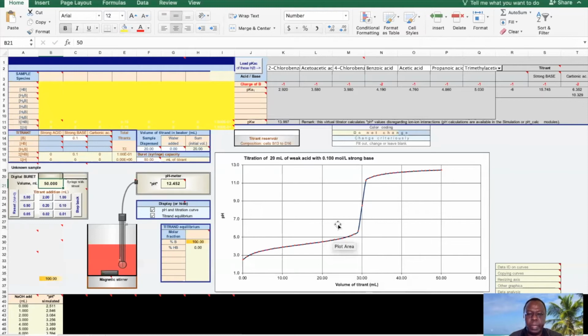And look at the characteristic features, all the signature. I want to see the title of the graph. I want to see the y-axis label. I want to see the x-axis label. Volume means what? Is it in liters? Volume of what? Titrant is what goes in the burette.